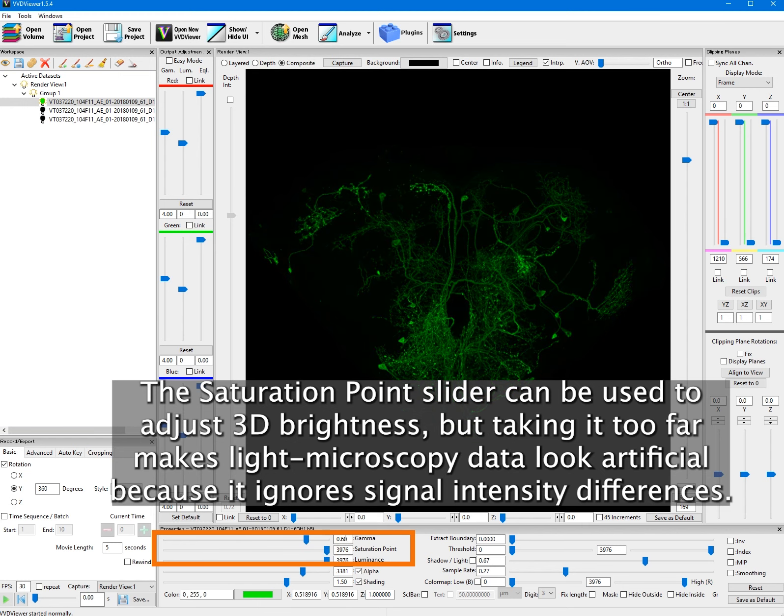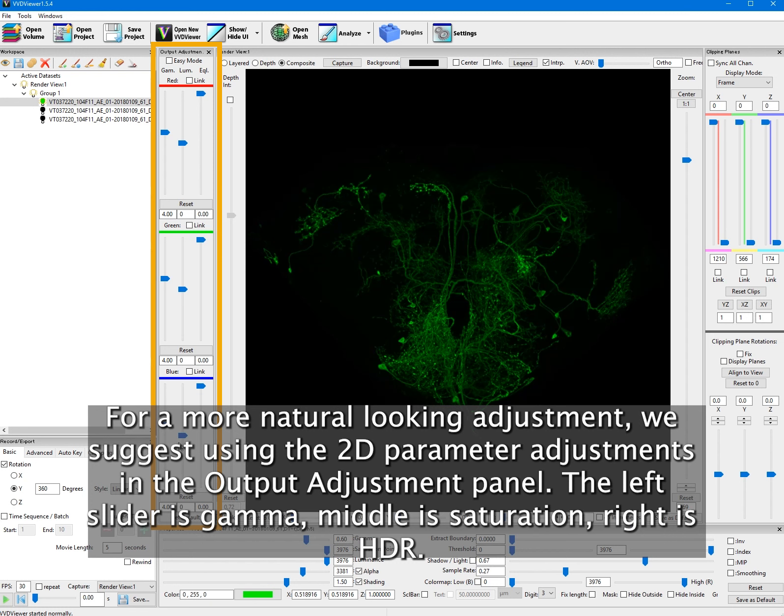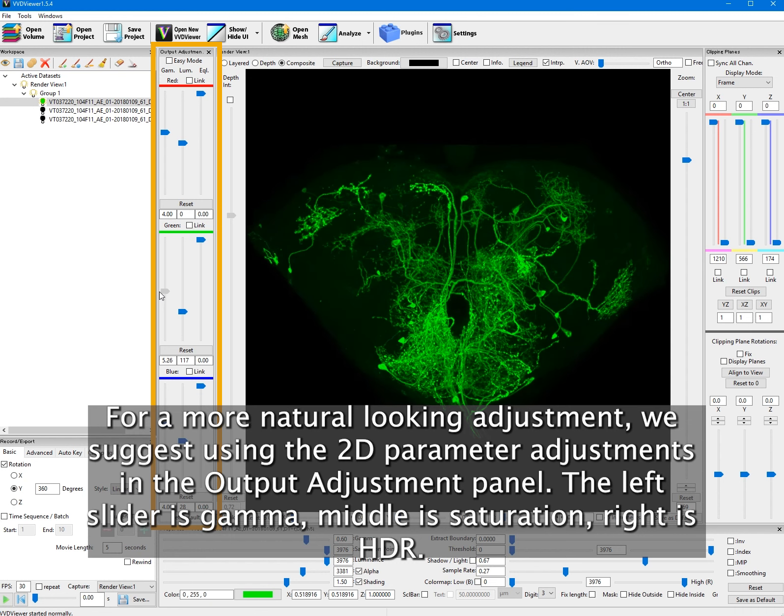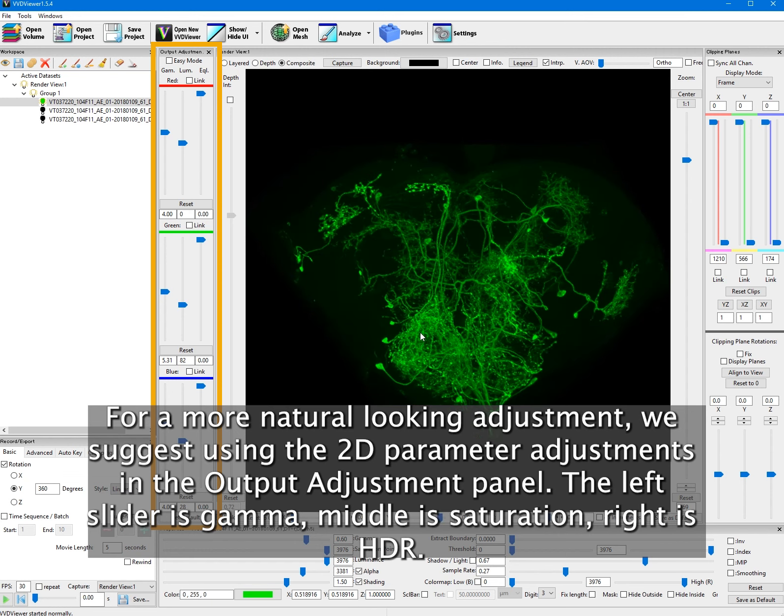For a more natural-looking adjustment, we suggest using the 2D parameter adjustments in the output adjustment panel. The left slider is gamma, middle is saturation, right is HDR.